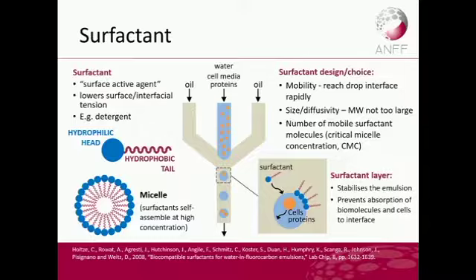The other factor that you want to keep in mind is the critical micelle concentration. This is the concentration where the surfactant comes together and forms a sort of sphere. In that case, it's taking up the concentration of the leftover surfactant available to act on the system. So you would want to choose a concentration of surfactant that's below the critical micelle concentration. Otherwise, it won't be as effective.